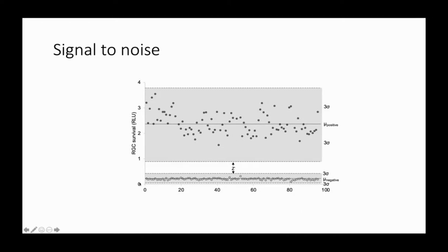If we put in control guides, we see a very consistent lack of survival, or death, at baseline. But when we put in various wells in 384-well format, guide RNAs that have been in vitro transcribed using the Echo system, we see increases in survival. Although there is some noise, there's such clear separation from background that this makes for a good screen.